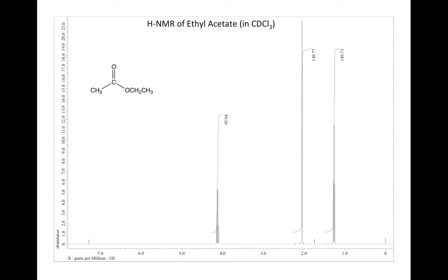Now what if you had a spectrum, and this occasionally happens, where there's no integration there? Well, then you sort of have to go based on peak height, and that's a little trickier because the peak widths aren't always the same, so then peak height doesn't work that accurately. But if we were going to take an example here, you can see this peak goes all the way up to here, that single peak, and this is broken down into 3 peaks.